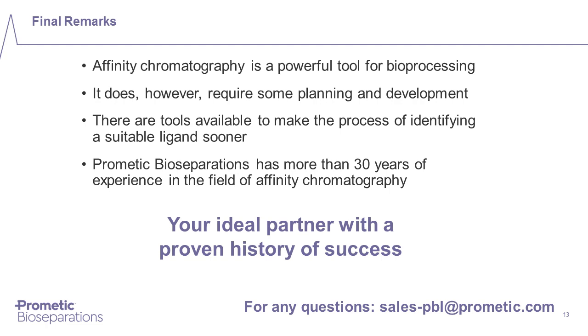And what happens if we get a hit on the screening plate? So if you get a hit on the screening plate and you come back to us and tell us which one that is, and you want to engage in a development program, there are two ways to proceed. One, maybe that hit itself is already good enough, and we would do the verification chromatography just to ascertain that, at least preliminarily.